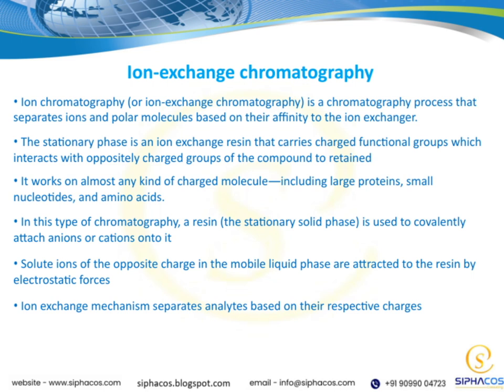The beauty of ion exchange chromatography lies in how it separates analytes, based on their charges. Molecules with different charge intensities or types will interact differently with the resin, allowing us to separate complex mixtures efficiently. This technique is fundamental in many analytical applications, especially when precise separation based on charge is required.